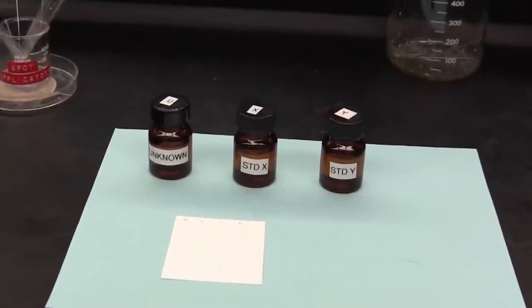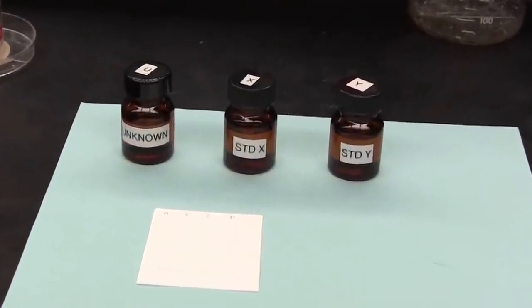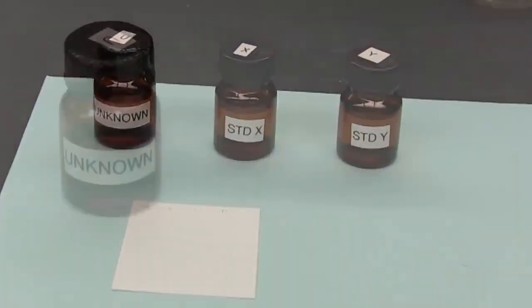In this demonstration, we're going to see how to separate and identify using TLC. In this bottle, the identity of the contents is unknown, but we do know that it contains either compound X or compound Y, or even a mixture of both.